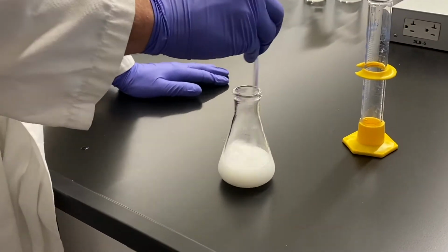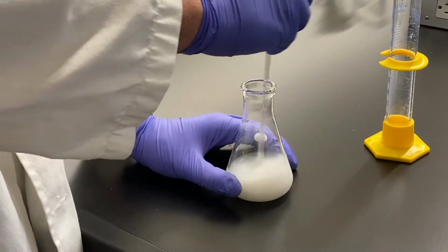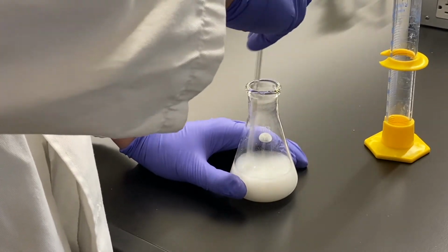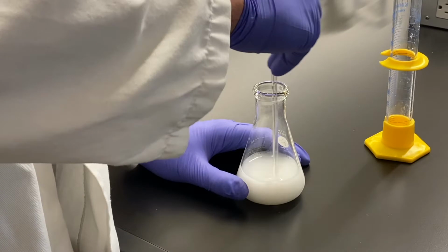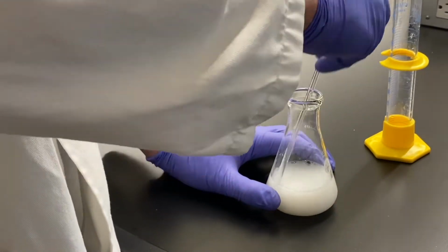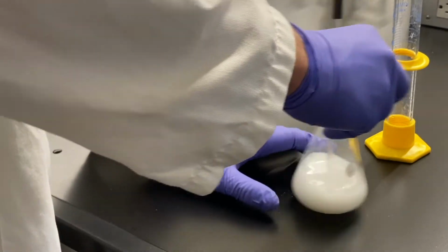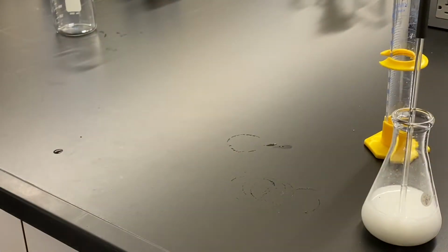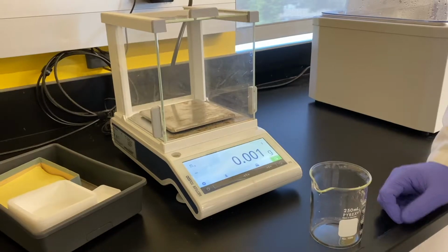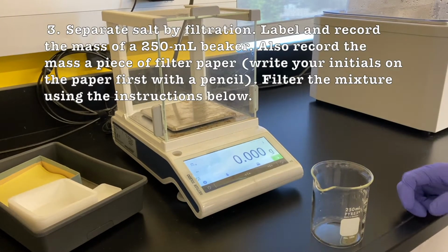And we're going to mix it up for a while just to make sure it all dissolves. We sped it up a little bit for you guys. It'll be a little hard to see when it all dissolves, just because the calcium carbonate and sand aren't dissolving. So we did a little extra time just to make sure.